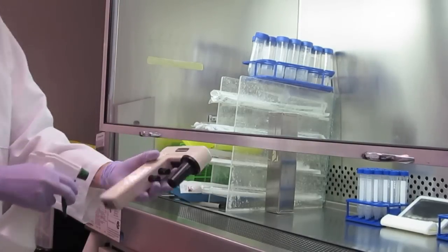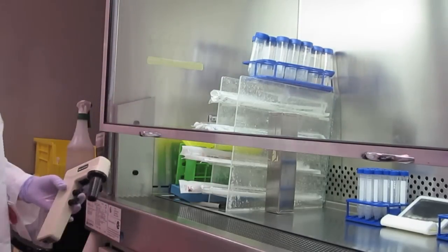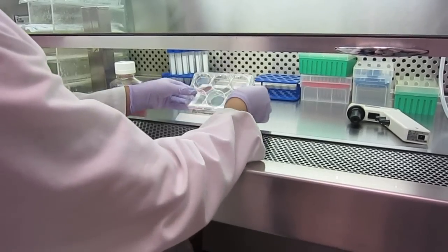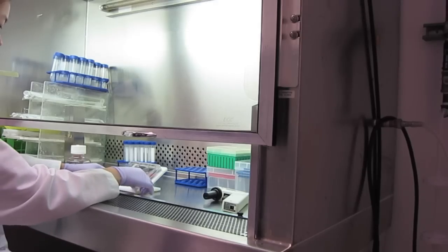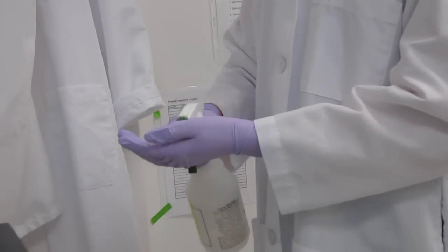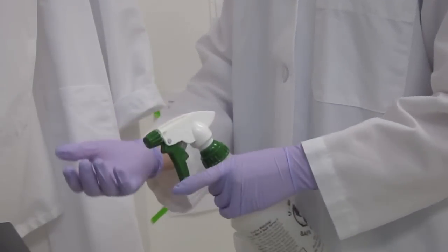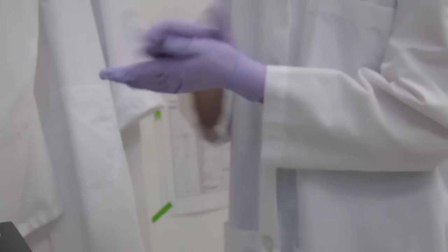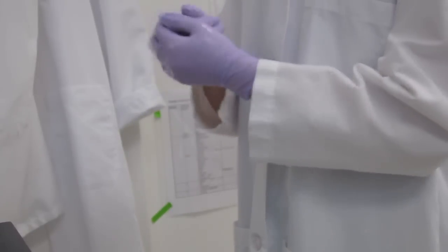Additionally, spray all items going into the BSC with 70% ethanol. Do all work 4 inches into the BSC and avoid leaving anything on the grill. Make sure you spray down your gloves every time before your hands enter the BSC, especially after touching something that may have been contaminated.